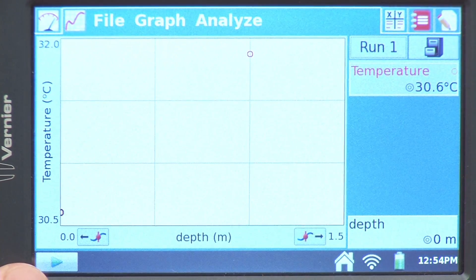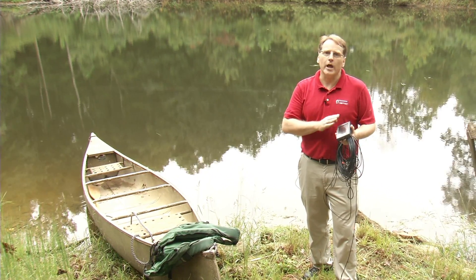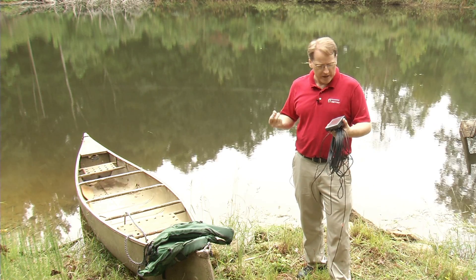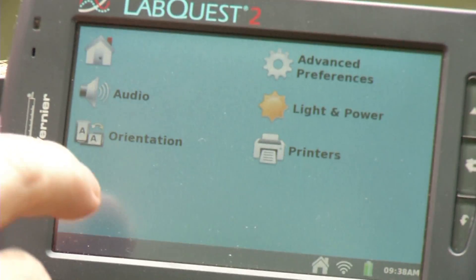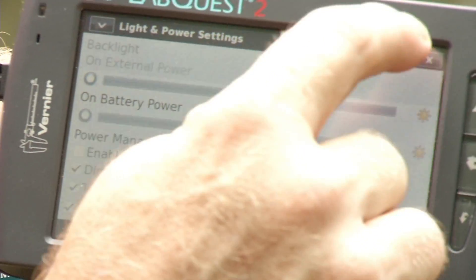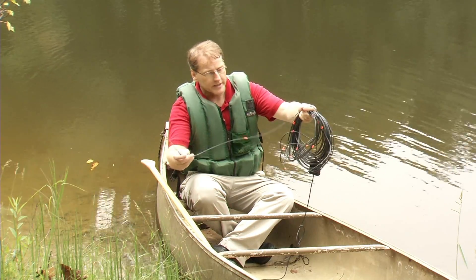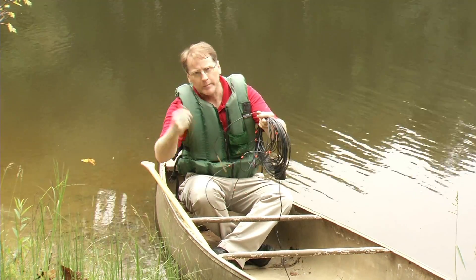I set up events with entry mode when I was inside. Now that I'm outside in the sunshine, I'd like to switch to high contrast mode to make the screen easier to see on the lake. To do that, I go to preferences, light and power, high contrast, and check the box — it changes the contrast right away. I also finished marking the extra long temperature probe inside in half-meter increments with the orange tape, so I'm now ready to collect data.